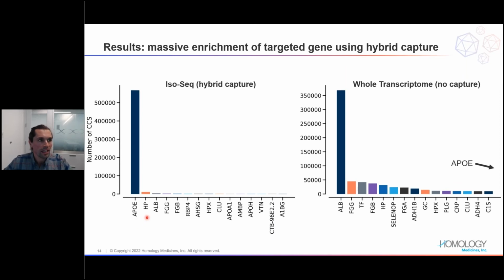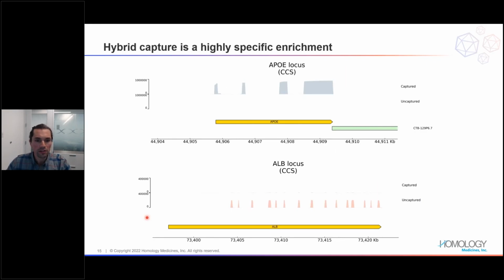I say this because it's something to really keep in mind when you're designing your probes for a particular gene, or a particular cDNA, that you're trying to capture. It's not necessarily a problem, but you just want to be aware of any off-target capturing. And so here's another view of this.